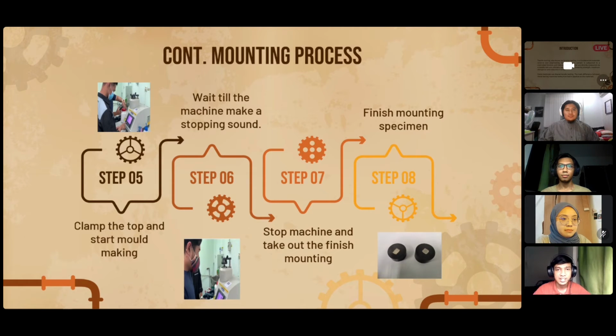Step 6, wait till the machine makes a stopping sound. Step 7, stop the machine and take out the finished mounting. And lastly, we got the finished mounting specimen.